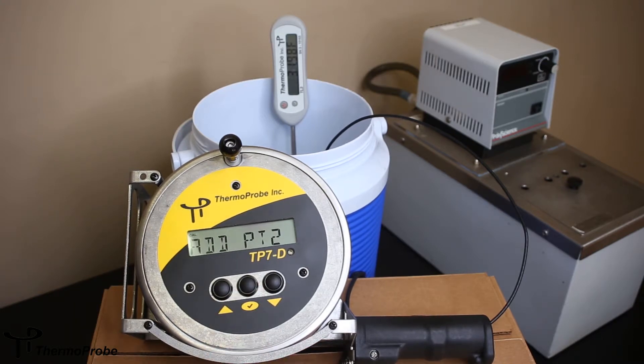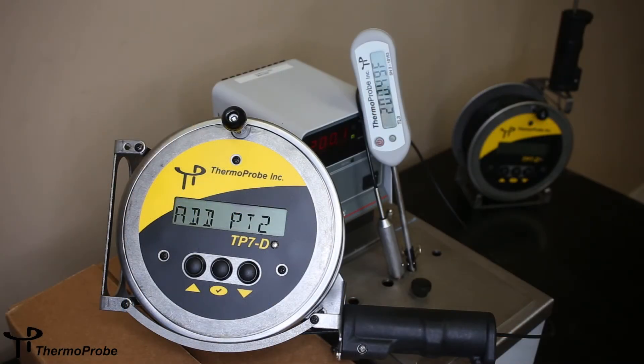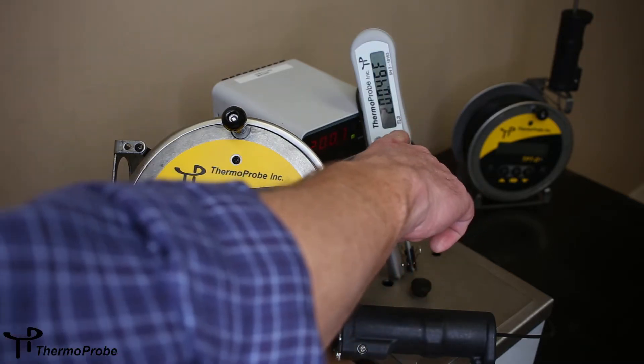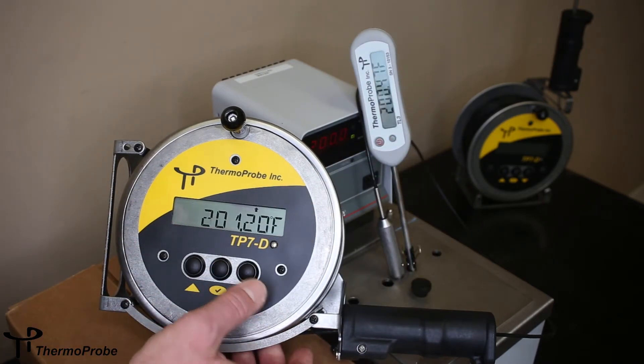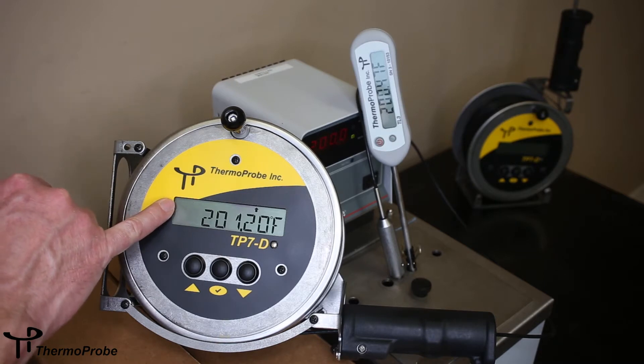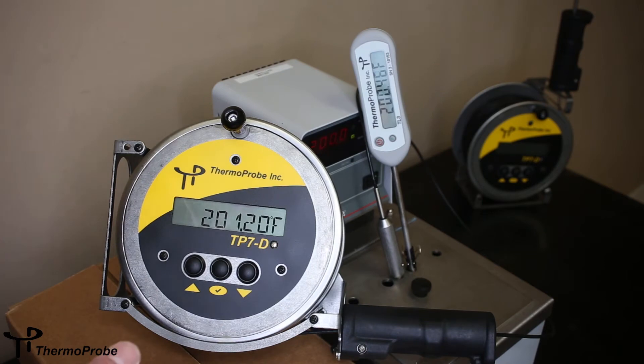Now it shows that we want to move on to point two. To continue the calibration adjustment on the thermoprobe, we moved to a 200 degree Fahrenheit bath. You can do the same using a boiling pot of water. Again, we used our same reference and moved it over. So we're showing at point two — we hit select, and now we're showing calibration at point two. We want to adjust the thermometer to read the same as the reference, so we're looking for 200.46.